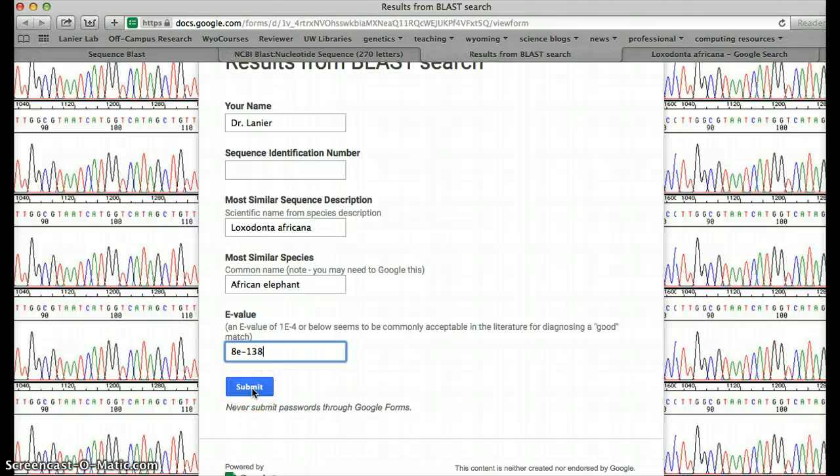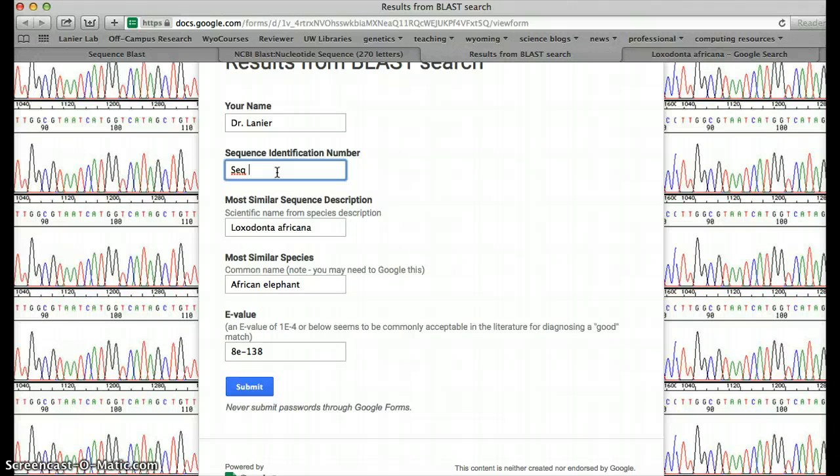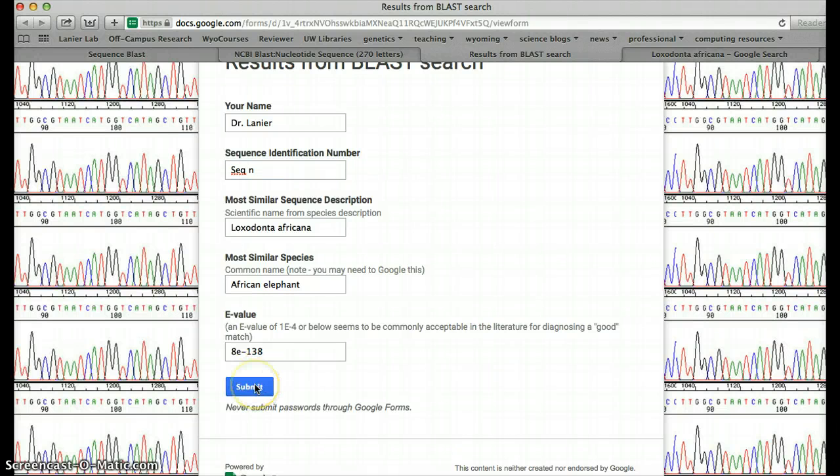And so you're going to put all this in. You're going to put your sequence number there if you've got one. I don't have one because mine is a different sequence. And you're going to hit submit, and that's all you have to do this week.